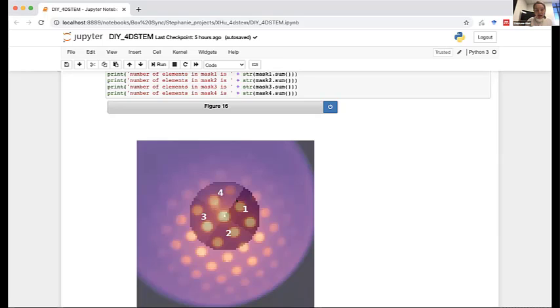The reason I like that you can change its orientation is that here you can see I've aligned it in such a way that none of the lines are slicing right through a reflection. If it was straight up and down, you might have something awkward where a third of one disk was spilling over into one detector and two thirds was in the other detector, which is not what you'd want. So let's go back up and look at the code to see how we got here.